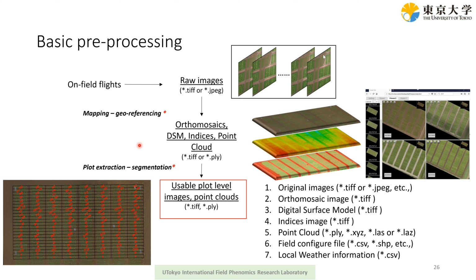And we also have the indices, which I mentioned over here, but I don't show examples of the multispectral images because of time limitations. But yes, we do the multispectral stuff, but we don't have hyperspectral at this moment. So we would like to have collaborations with people who are analyzing hyperspectral images too. Mm-hmm. Okay, cool.